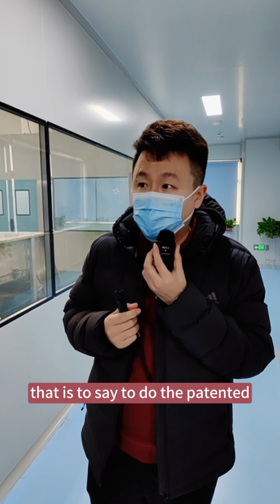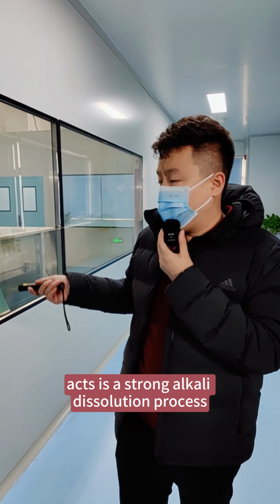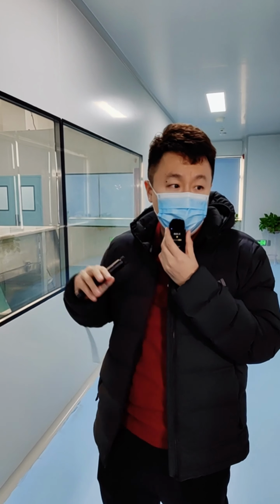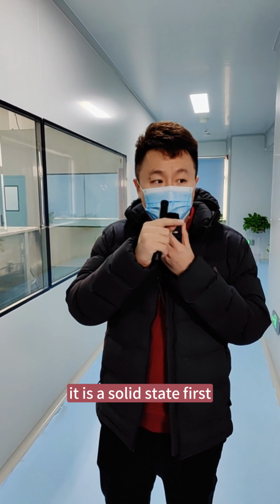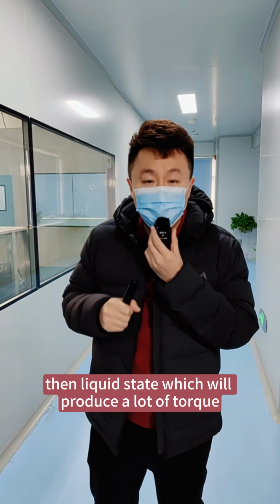in cooperation with us. That is to say, to make it patented, because our reaction axe is a strong alkali dissolution process, because our bile paste is acidic, with a pH value of 3 to 4, and it can only be dissolved by strong alkali. Why is its agitation designed independently? Because in the process of dissolution, it is first a solid state, then solid-liquid coexistence, then a liquid state, which will produce a lot of torque in the middle.